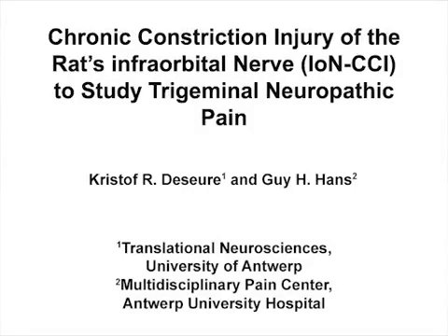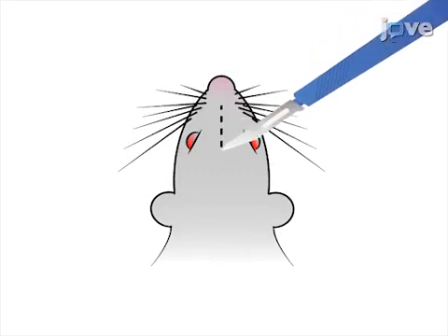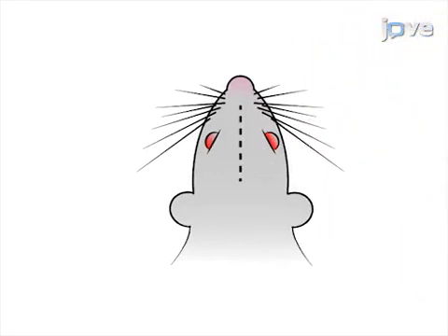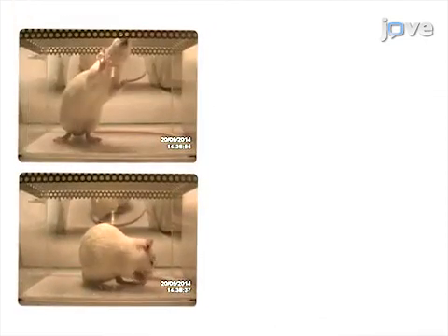The overall goal of this procedure is to study trigeminal neuropathic pain in rats via a chronic constriction injury to the infraorbital nerve. This is accomplished by first making a midline scalp incision and exposing the infraorbital nerve, then constricting the infraorbital nerve by placing two loosely tied ligatures around the nerve.